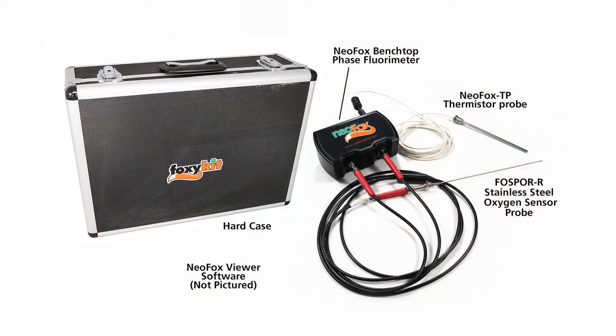Today I'm going to show you how to calibrate your NeoFox probe kit and your NeoFox patch kit. We're going to do liquid and oxygen phase calibrations. We'll be starting with NeoFox probe kit and gas phase.